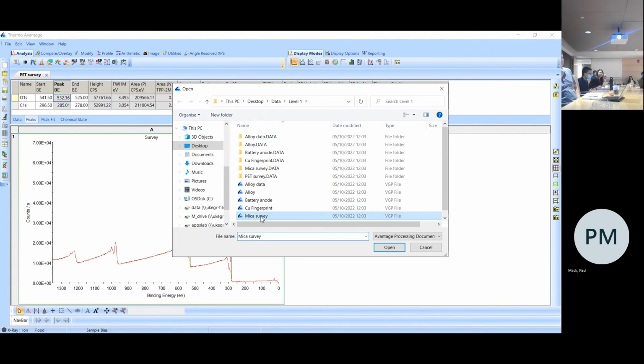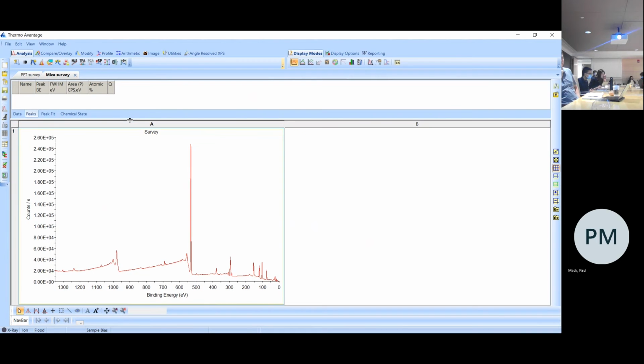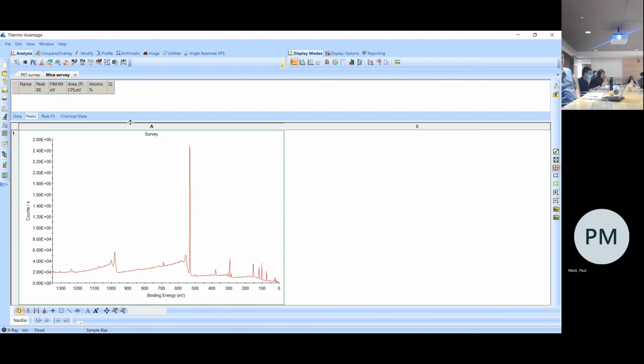Greg was asking that they often get a lot better results with ESP. Is there a reason why you would typically use the automatic survey ID? I tend to use survey ID mainly because it does it in one go, and then I can do the manual ID. It also gives me less information. I find the ESP can be a little bit overwhelming sometimes in the information it gives. That's the only reason. If you're happy with ESP, then go ahead and continue using it. No problem at all.